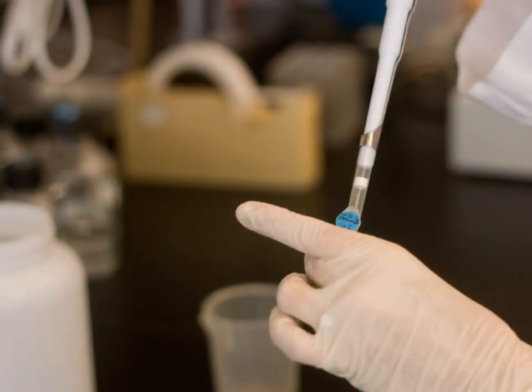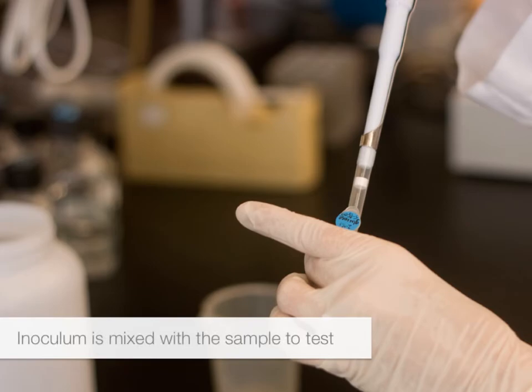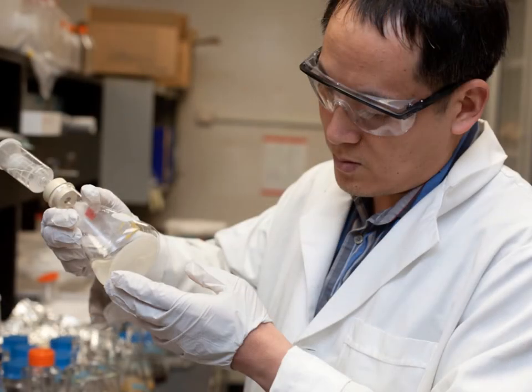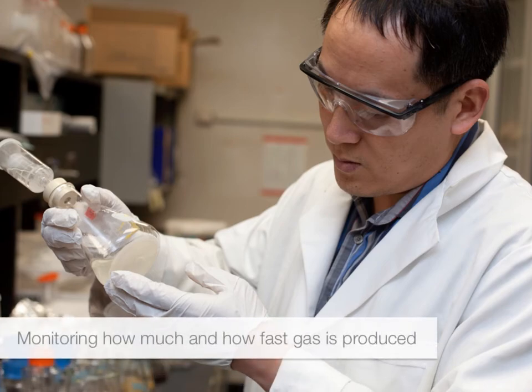The test is quite simple. An inoculum is mixed with the sample substrate to test. This inoculum contains all the microorganisms necessary to degrade the substrate. The mixture is then monitored to see how much gas is produced and how much time it takes.